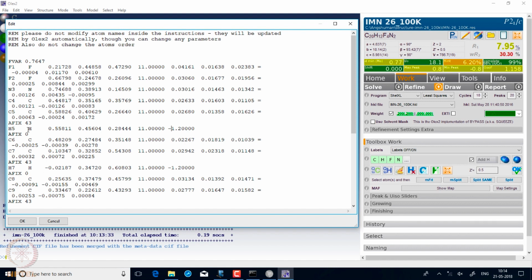So the thermal parameter on this hydrogen is also based on the thermal parameter of the parent carbon. This type of refinement is called the riding model of refinement, as if the hydrogen is riding the horse, which is the carbon to which it is fixed. This riding model of hydrogen is used in almost all the data sets that are done using X-ray diffraction analysis.